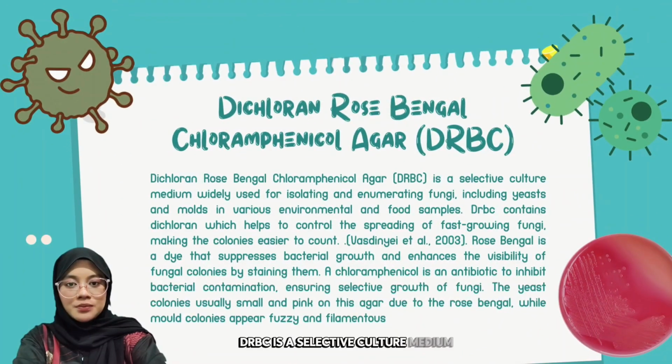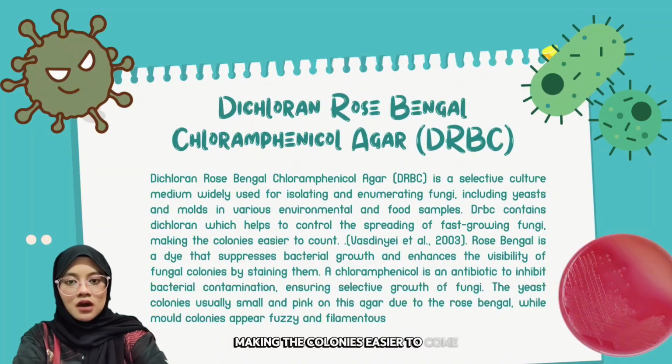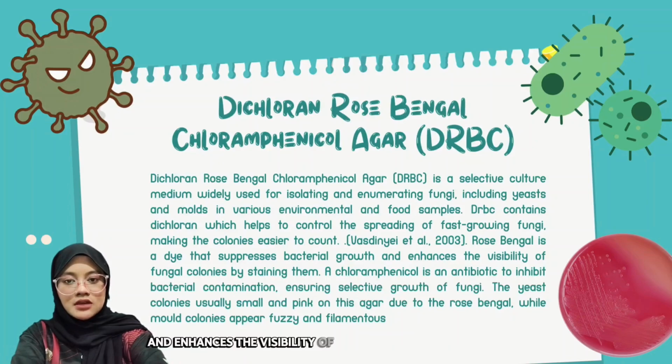DRBC is a selective culture medium widely used for isolating and enumerating fungi, including yeast and molds in various environmental and food samples. DRBC contains dichloran, which helps to control the spreading of fast-growing fungi, making the colonies easier to count. Rose bengal is a dye that suppresses bacterial growth and enhances the visibility of fungal colonies by staining them.